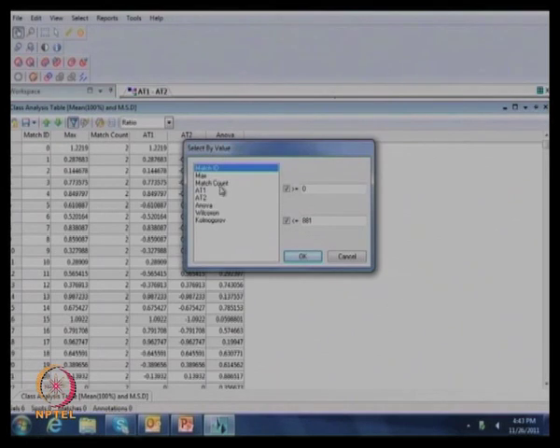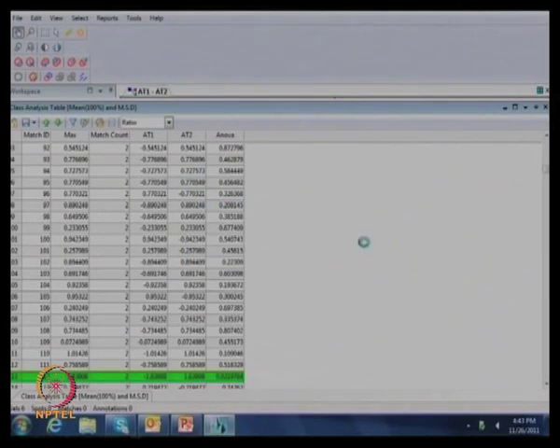Now what we are going to do is, first the ANOVA value, the maximum we are going to take is maybe 0.05 as the statistically significant value. So those many spots can be highlighted. Okay, right.